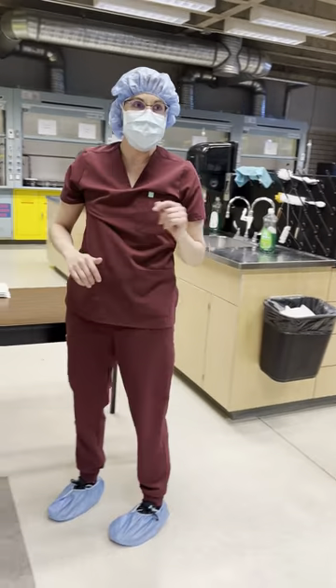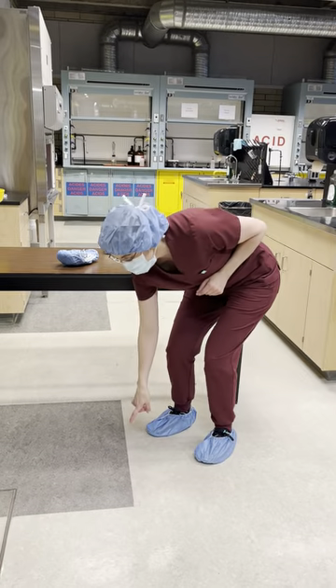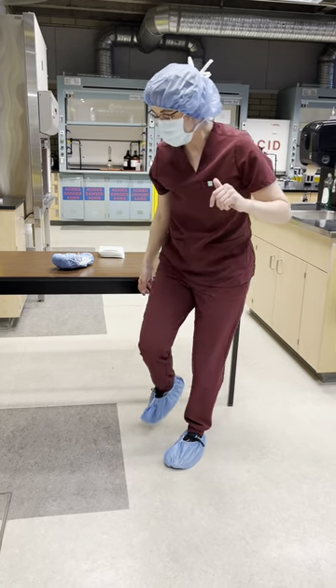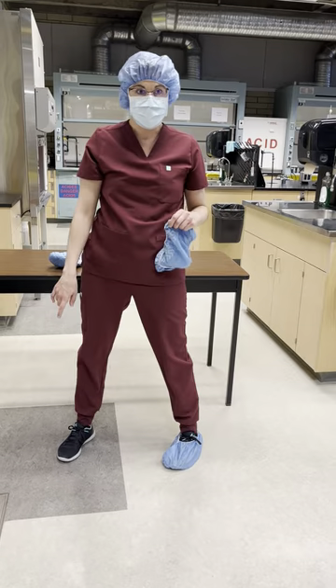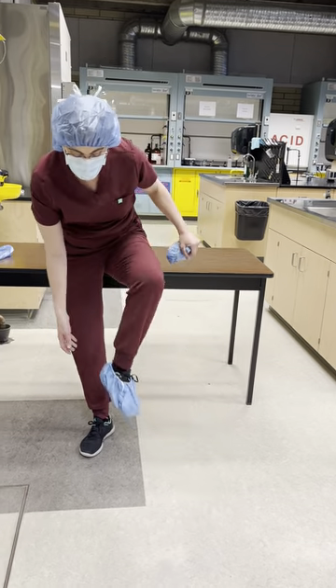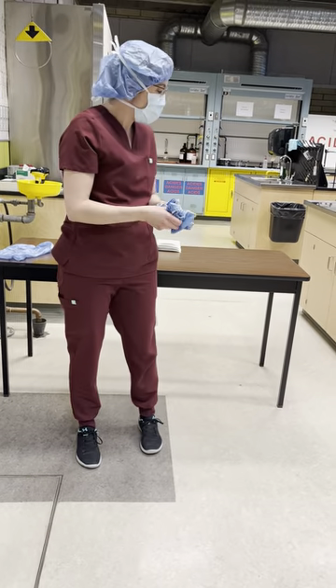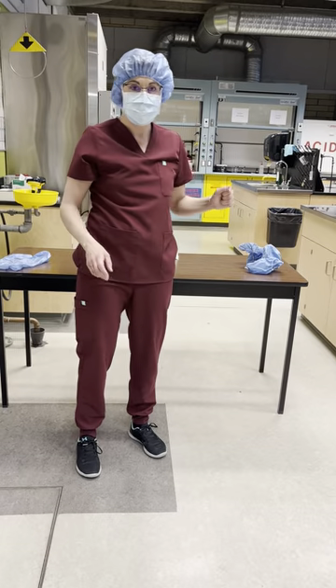As you're crossing over from the clean side to the dirty side — your line of demarcation — you're going to remove one shoe cover, step over to the line into the dirty side, remove your other shoe cover, and step onto the dirty side of the ante-area, and dispose of that properly.